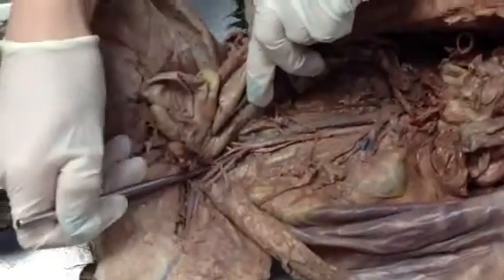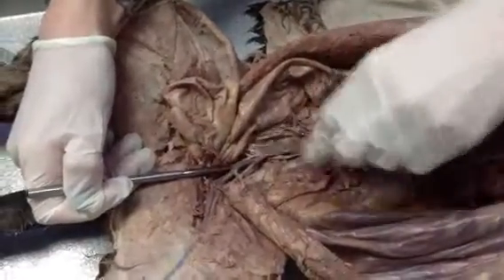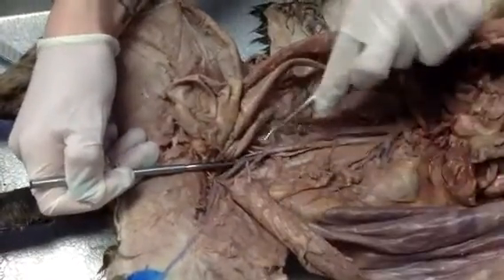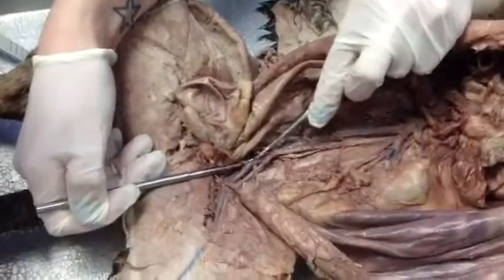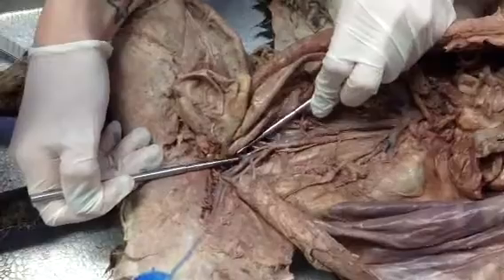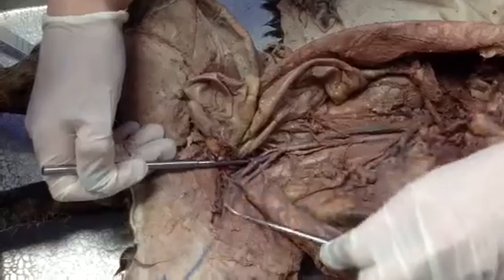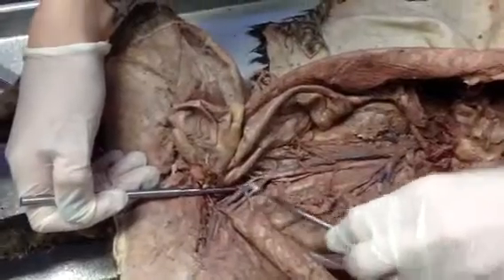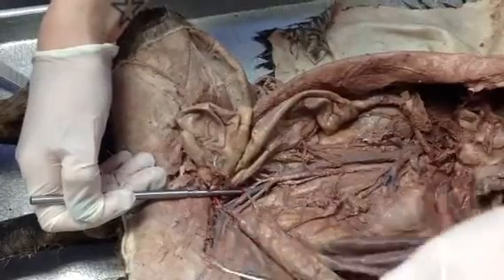Okay. So with the iliacs, that's always one vessel. So here we have the branching. Here's one, there's two. And you can see here's all one vessel, all right? So up till this small one that goes inside that I'm holding up here, this part, that's the common iliac. The one that I'm holding up here that goes straight inside, that's the internal iliac vein. This part is the external iliac vein, and as soon as it goes into the leg, it's the femoral vein. Okay, so up here, common iliac, internal iliac, external iliac, femoral vein. Right?